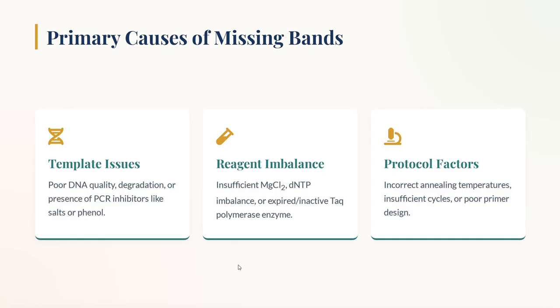Another reason could be reagent imbalance. When you have insufficient MgCl2 in some of the reactions, that could be the reason. dNTPs, if they are imbalanced or expired, or the Taq polymerase enzyme is expired, or if it is added in less amount, that could also be the reason.